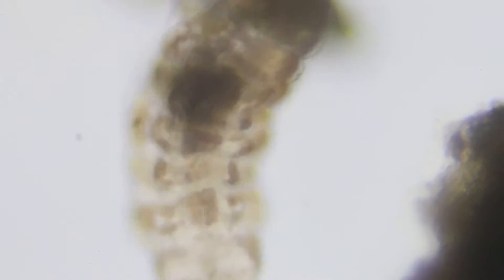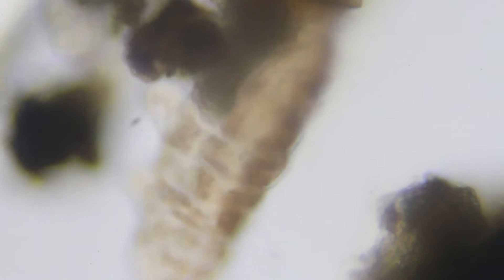This is like... You are a pile of moss down the water bear. Oh no. Don't eat me like a water bear. Very slowly. Harder than it looks to track a water bear while a child acts like he's a water bear and tries to eat your arms. Just saying.